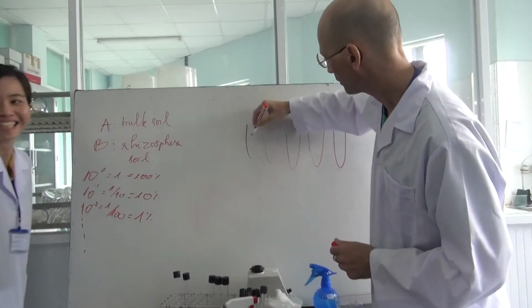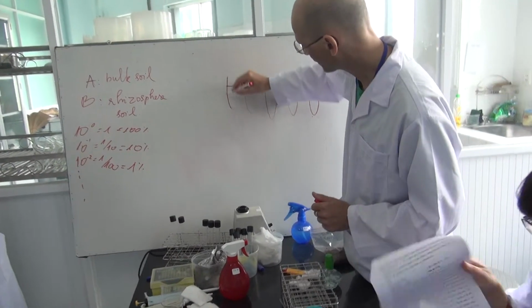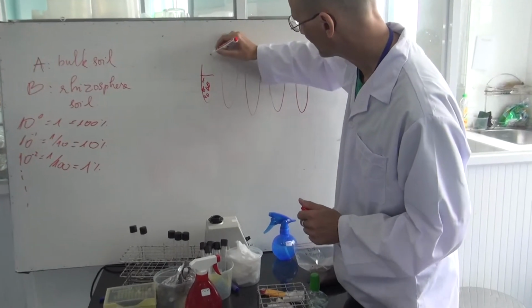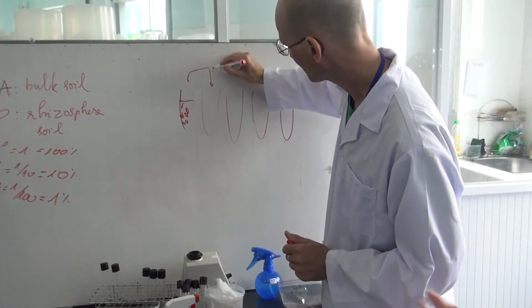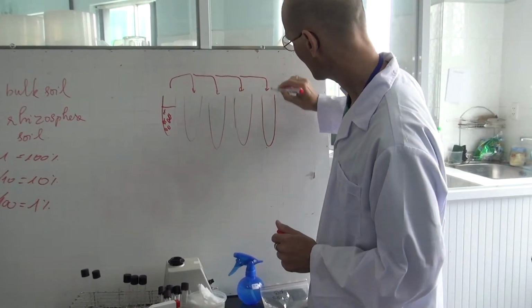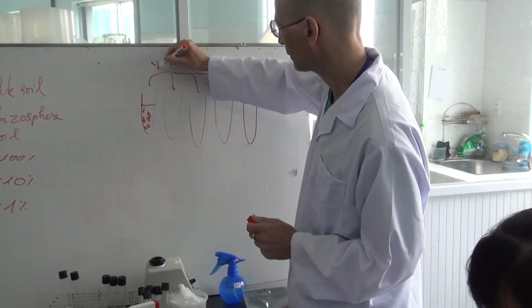Okay, so let's say that in this one we have a soil sample, okay? And we have made these dilutions. So this is 1/10.